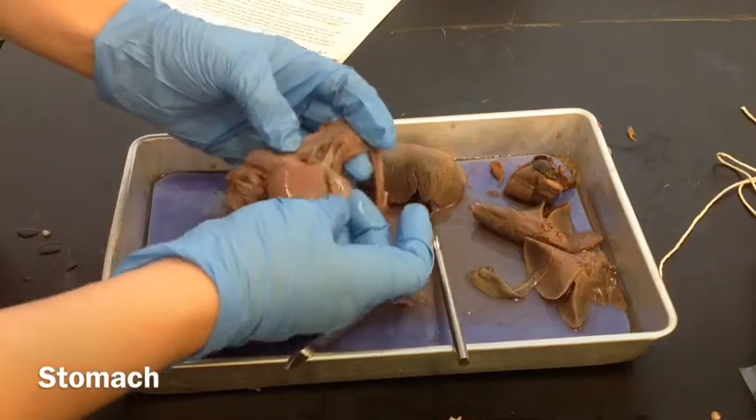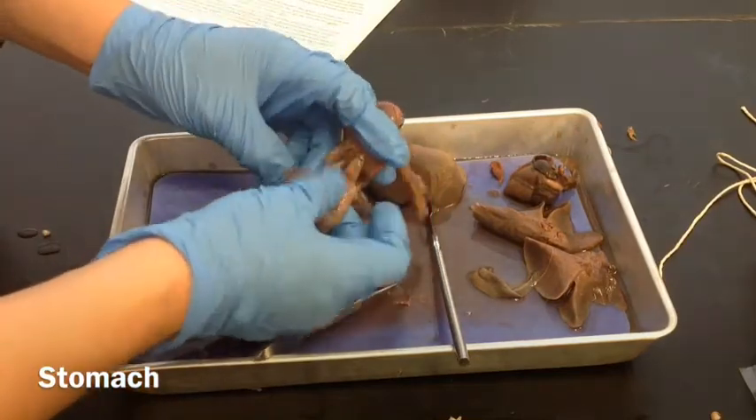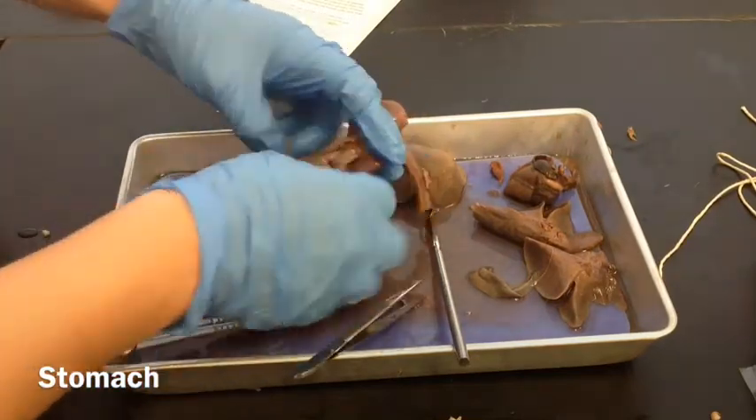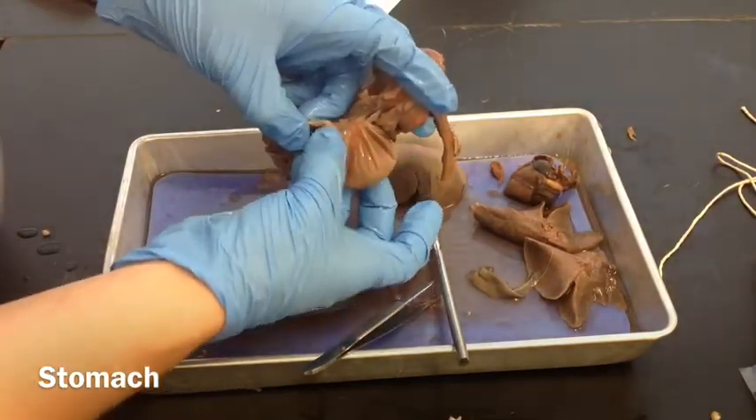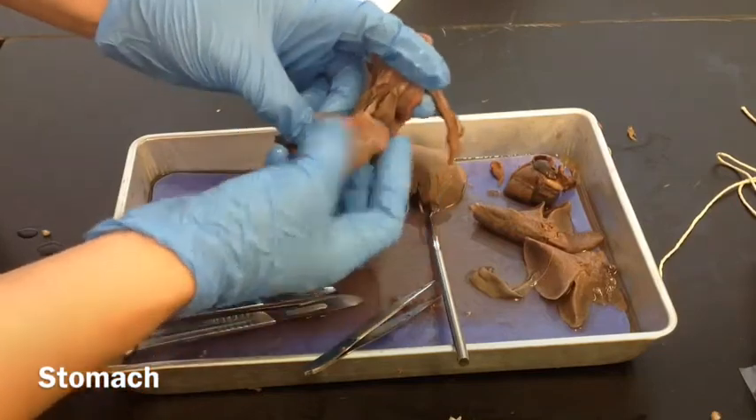It goes through the different parts of the stomach. This is the cardiac part, and then it makes like a J-sack, and over here is where it goes into the small intestine — that's where it connects to the small intestine.